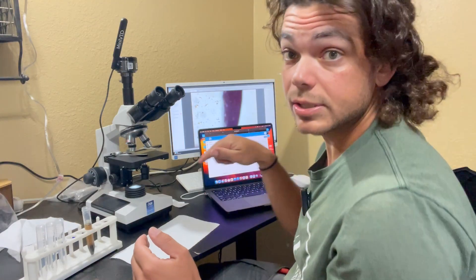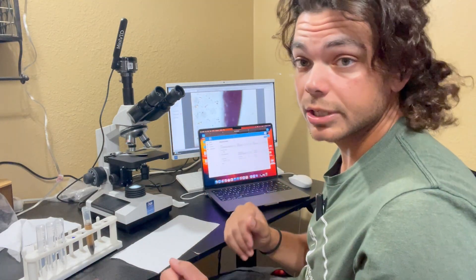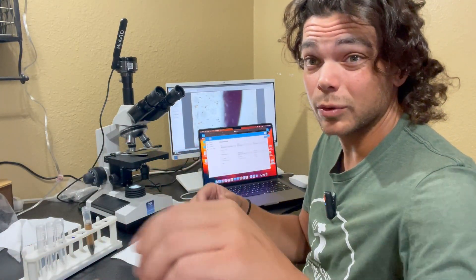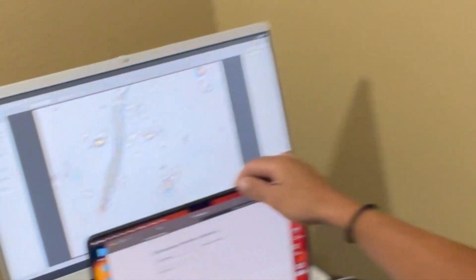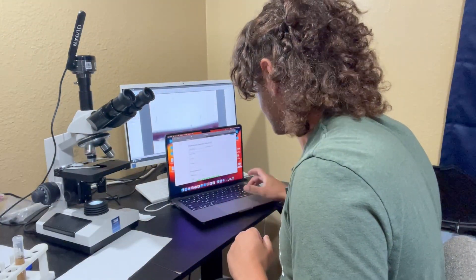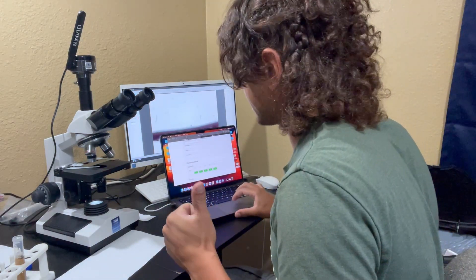I'm going to start my nematode scan — scanning around the outside first, then doing five laneways back and forth over the cover slip to see if I have any nematodes. They move kind of quick. You can actually see on there right now — that is a nematode. That is a bacteria-feeding nematode. That's a good guy. Preliminary: I saw two bacteria-feeding nematodes, which are good guys.